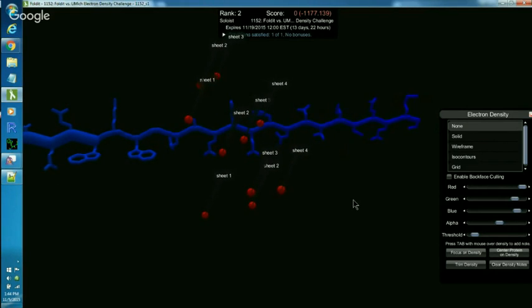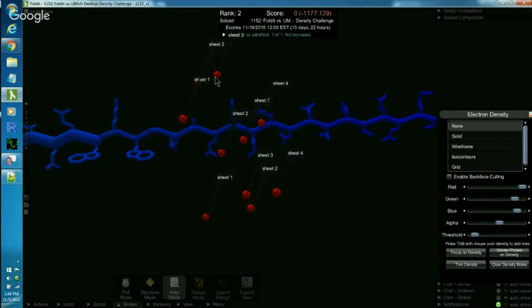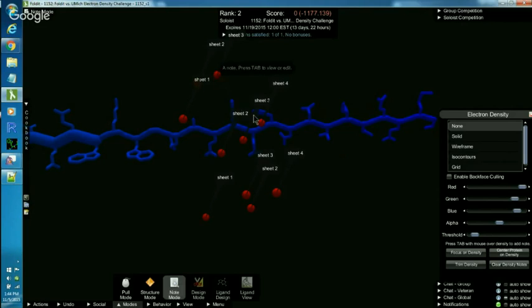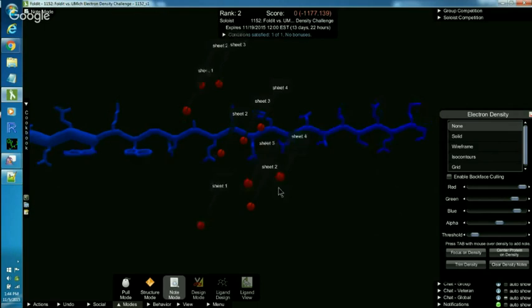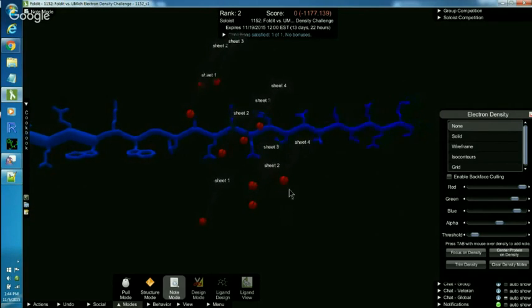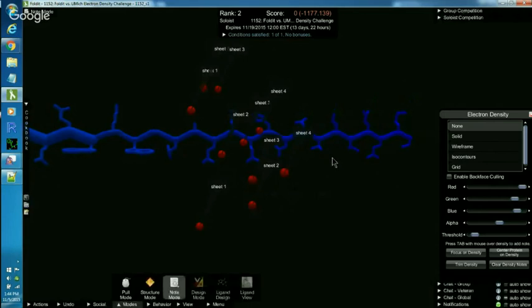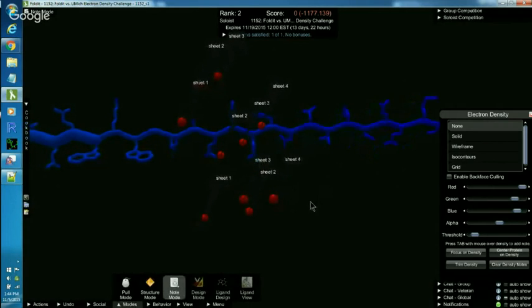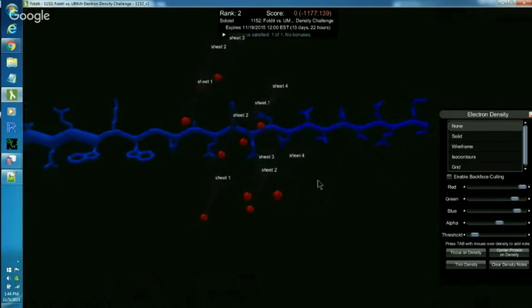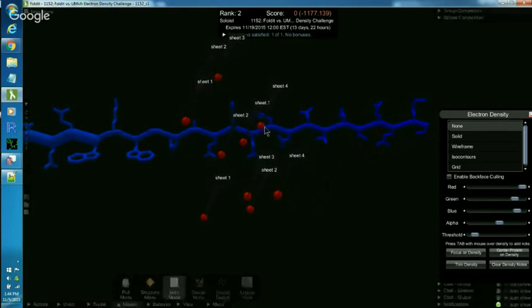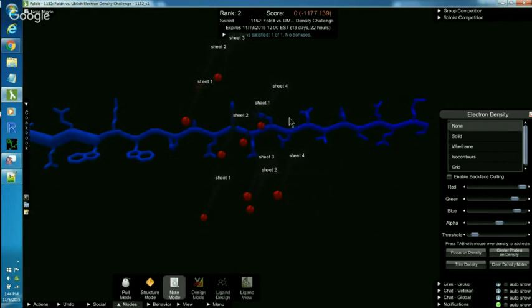And you remember I said that sheets don't make flat surfaces. They make curved surfaces. I can see already that these sheets are bent. The sheet number three starts in the back there, comes over here to the middle, and then it actually ends over here. Not a straight line. It's in front of and above the end of sheet two. So when you're putting your sheets in to match your dots, don't be afraid to put a cut right in the middle of the sheet and just bend it at that spot so that you can fit it accurately to the cloud.